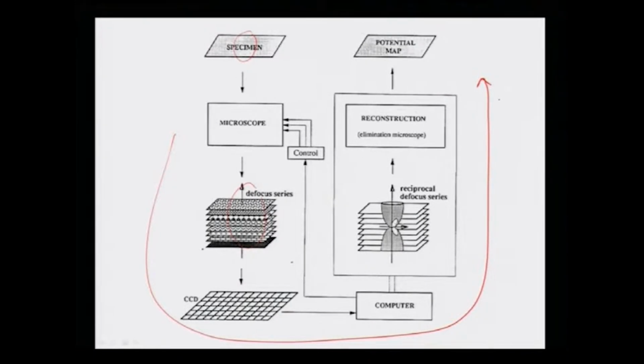That is why nowadays people provide these high-resolution images in the different papers or books, just for the sake of increasing the quality of the images. Many times we find that the exact information from these images is lacking, both in papers and sometimes in books also, because of this problem of simulating these images and getting quantitative information.